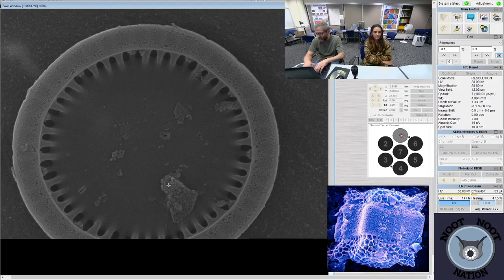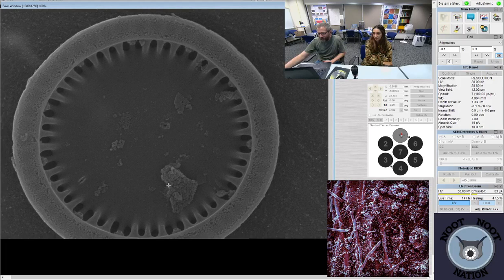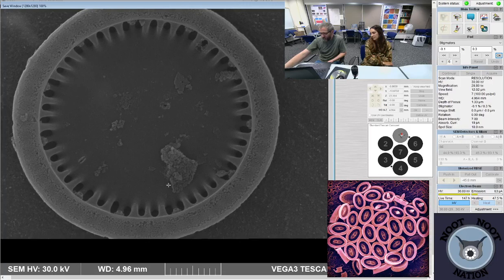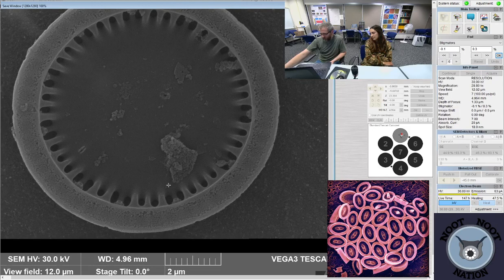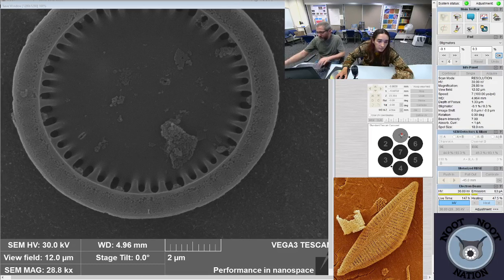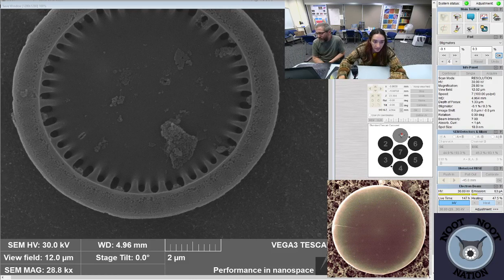There's a link to the Lindavia. I will get you costei and intermedia. I believe both of those are on Diatoms of North America, which is where I usually grab stuff from. Actually, costei is not on this webpage, but intermedia is. So we saw intermedia. It's the bigger one, the one that we just looked at before this point, and that's this one. And costei is not on here. Lindavia costei. Like that? C-O-S-T-E-I, yeah, just like that.